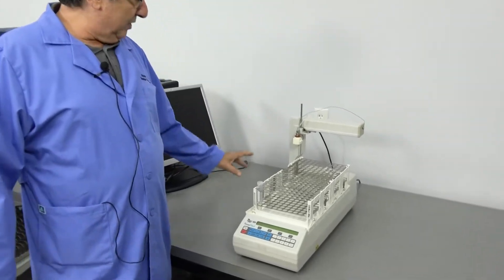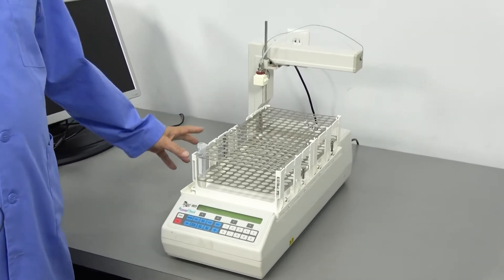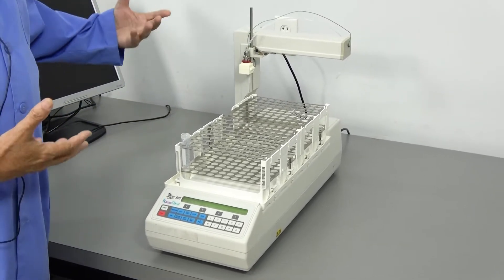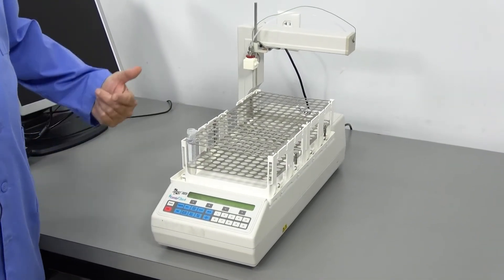This particular one is in very good shape, seems to work very well, easy to program. It's something that I know people don't use their equipment because they don't know how to use it. Very easy system to use.